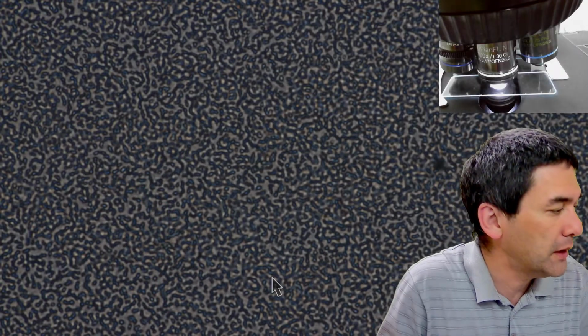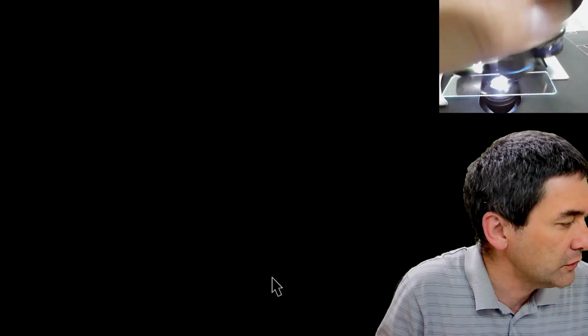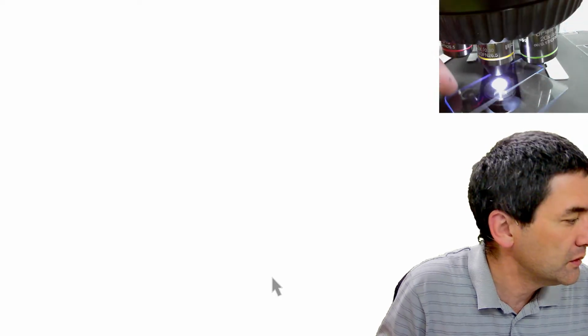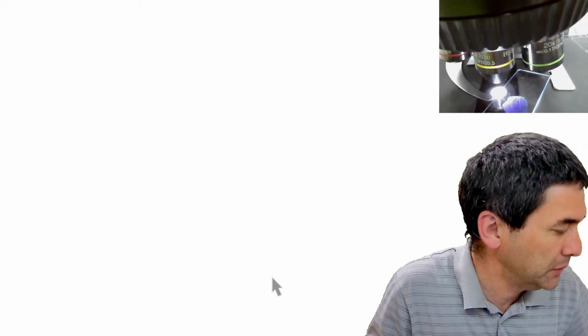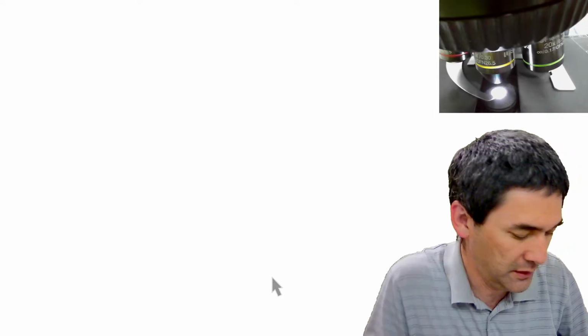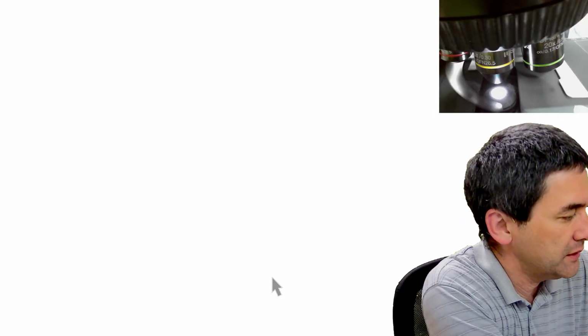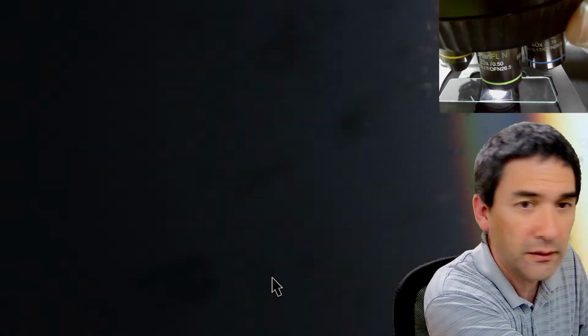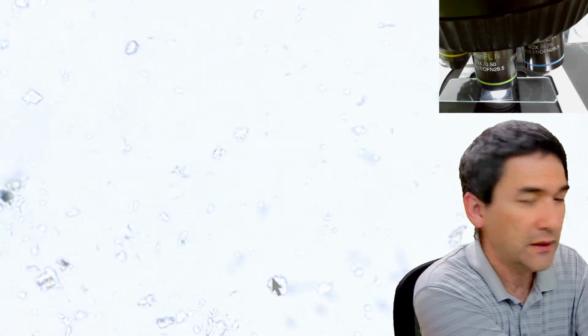Okay. Thank you for the recommendation. I don't know how it will look like. Let's remove the old slide. Two old slides here. Oops, I dropped it. Doesn't matter. So let's put in the slide directly with the E. coli freeze-dried powder. And let's focus again.